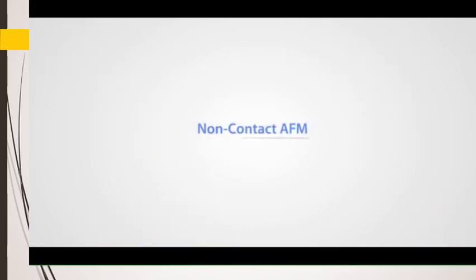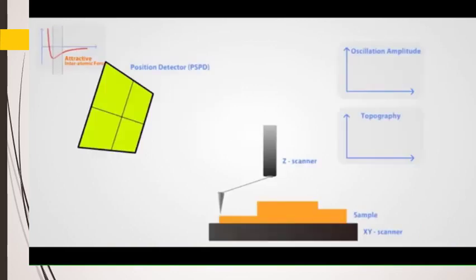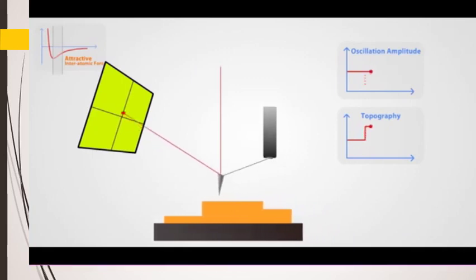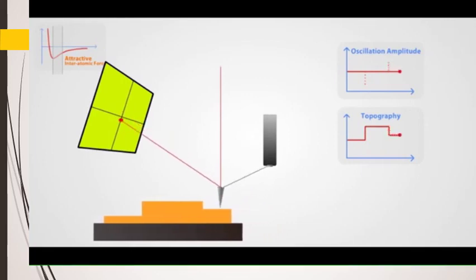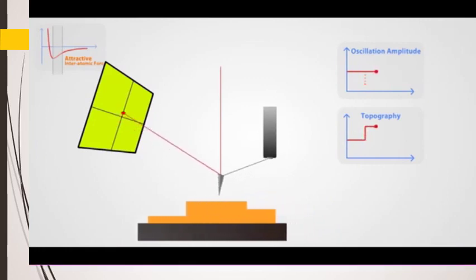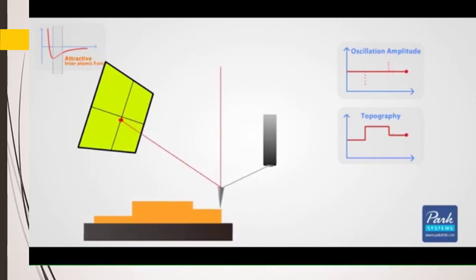In non-contact AFM, the cantilever oscillates just above the surface while it scans, but the tip does not touch the surface. A precise, high-speed feedback loop is used to keep the cantilever tip from crashing into the surface, thus retaining tip sharpness and leaving the surface untouched. As the tip approaches the surface, interactions between the tip and the surface cause the oscillation amplitude of the cantilever to decrease. The feedback loop corrects for these amplitude deviations and constructs an image of the surface topography.